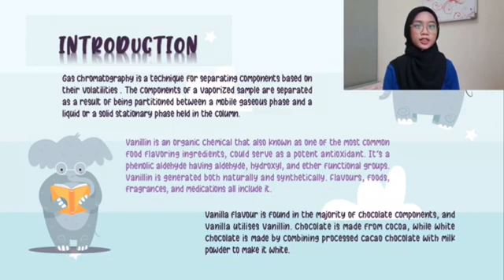For introduction, gas chromatography is a technique for separating components based on their volatilities. The components of a vaporized sample are separated as a result of being partitioned between a mobile gaseous phase and a liquid or a solid stationary phase held in the column.